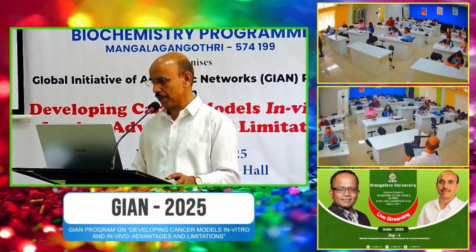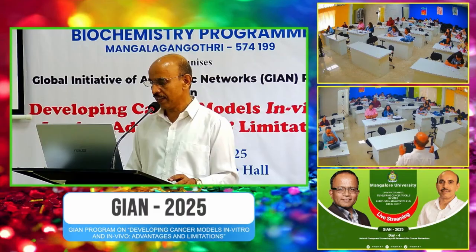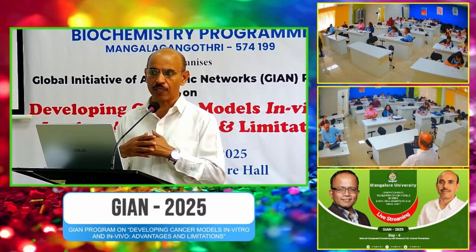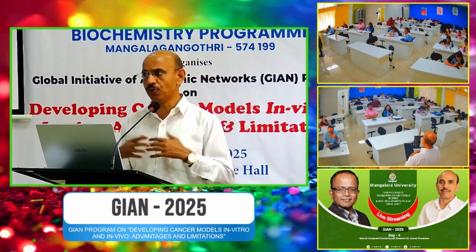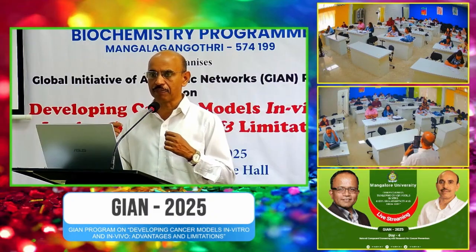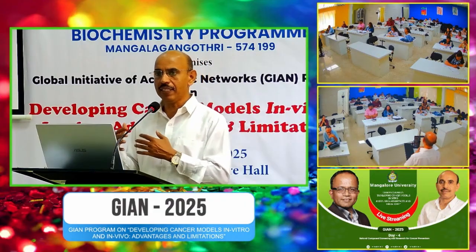And what are the key aseptic techniques required to prevent contamination in cell culture? What are the aseptic techniques? In the sense, that's actually the good laboratory practice I am talking about. So when you enter the lab, make sure that you are wearing the lab coat. And once you enter the lab, make sure that you are tying your hair, because when you are working in the biosafety cabinet, that may lead to contamination of the cells.